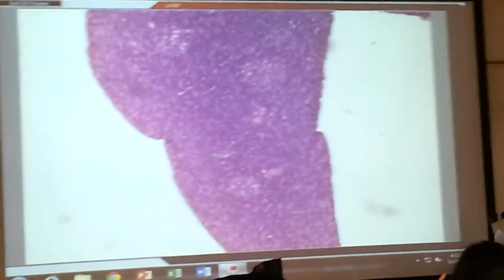And then the last one is pancreas. And pancreas, again, there's a lot of purple cells all over the place. The big thing about the pancreas, you can almost pick them out even here. You see that slightly lighter island there? Those are the islets of Langerhans. And usually they jump out a little bit better when you zoom in once. Just a little bit. That's a little better.